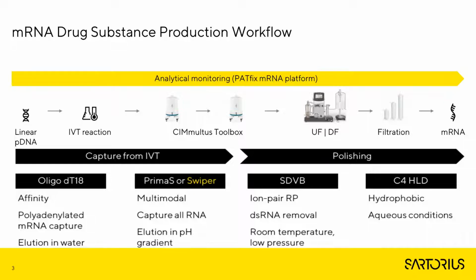We offer here many different approaches when it comes to the capture and polishing of the mRNA itself, but today's focus is going to be more on how analytics can support this process, both IVT production and then downstream purification.